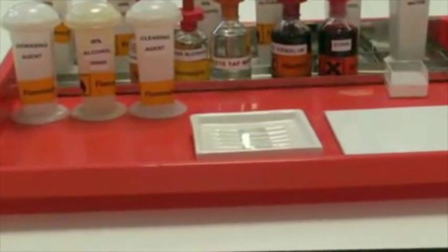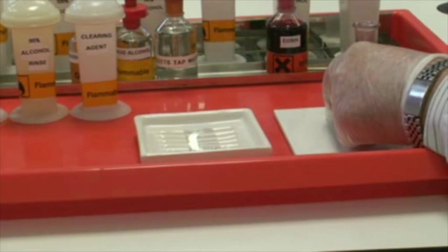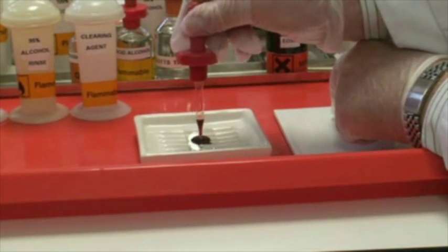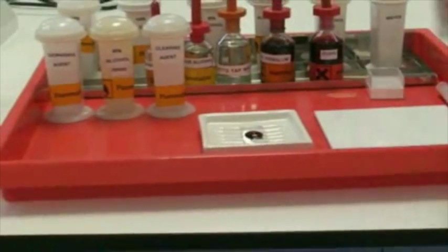We'll now transfer the section across for the very first part of the staining procedure, put it into position, and we are ready to go. I'm now going to place several drops of the Mayer's hematoxylin onto the section, sufficient to cover it. The next step is to start the clock for five minutes, and five minutes only.